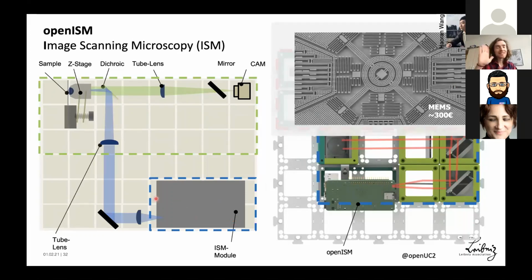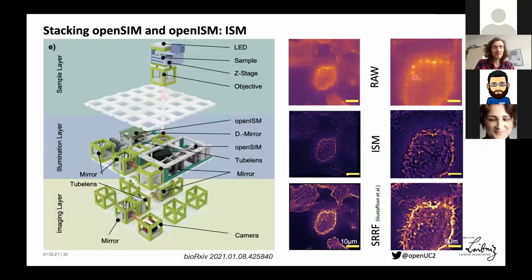And it basically deflects the laser in this case. And you have 3 different laser wavelengths, for example, RGB, which can excite GFP and Alexa 647, for example. And then you can create a pattern in the sample plane. And since we thought, okay, they are very similar, and we would like to test both of them, and we had 2 electrical components, both open source, both very reliable, we thought, well, let's combine it and see how this goes.